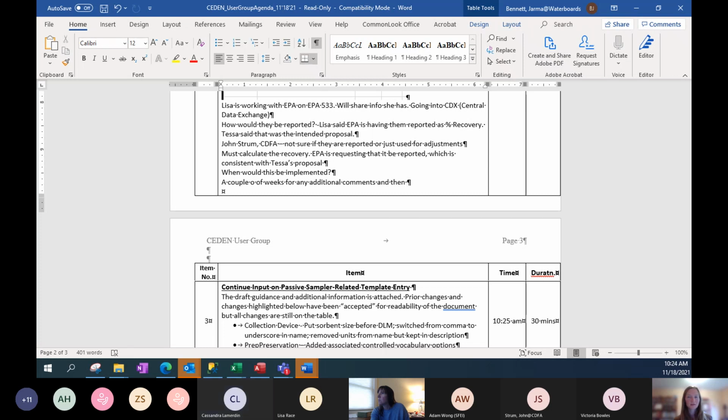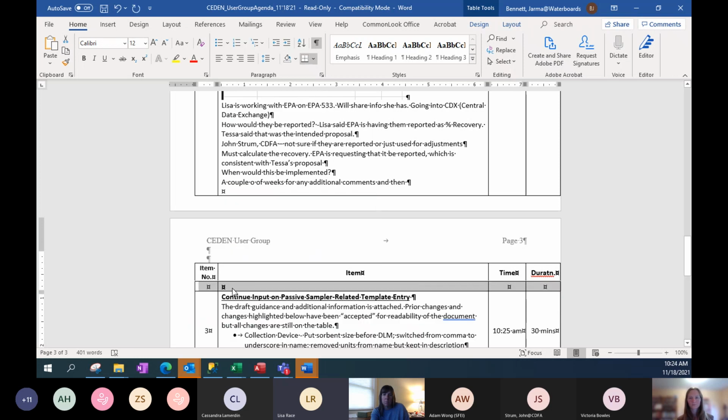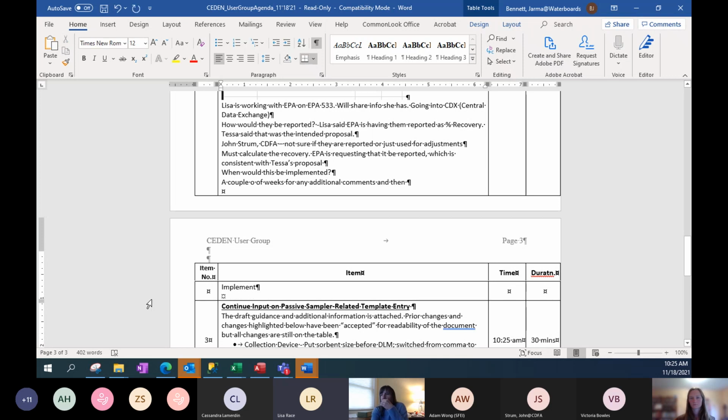Lisa, do you want to respond to that, or do you have a separate question? I can respond to that. It's great to have a lab tell us. The way the methods are written, there are some where you are allowed to choose the compound for your surrogate or your internal standard. I know in our lab, we have one that is used both as an internal standard in one method and a surrogate in another method, just because of the limit on what compounds you can get for standards and pricing. We try to keep the price down so we can keep your price down.